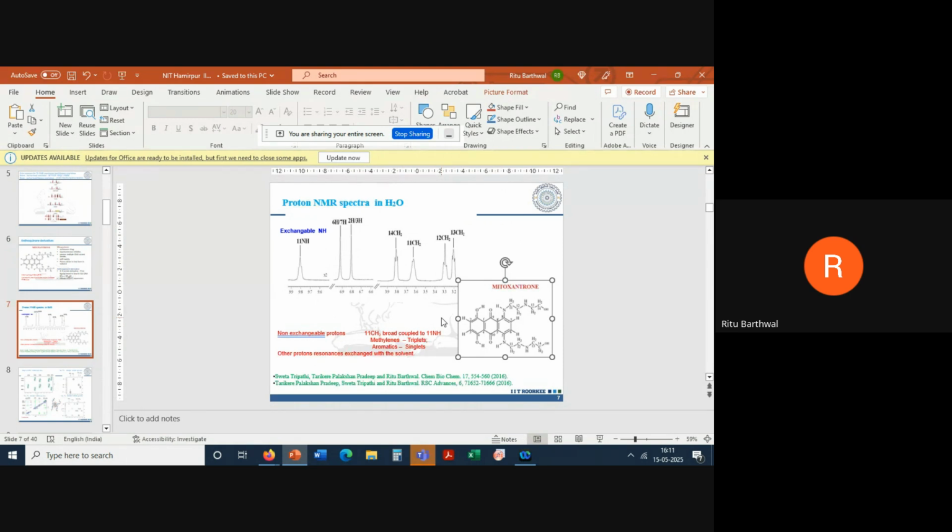So this is a very small molecule that I have taken just to show you. This is chemical shift, the resonances of each CH2, each H actually. This H may be a methyl, this H may be CH2, this may be aromatic CH, or this may be NH or OH. Each one will give its own peak. First of all, it will be spread out, so from the region I know this is the region of CH2 and so on. Next, I can put a cursor here and determine the conformational angle.